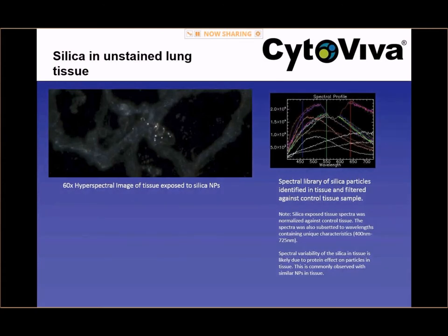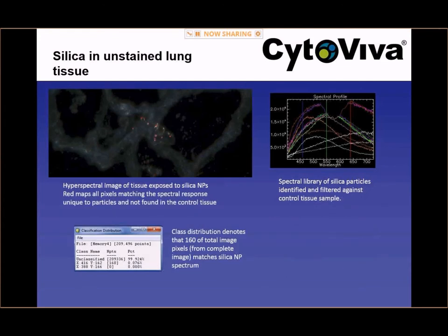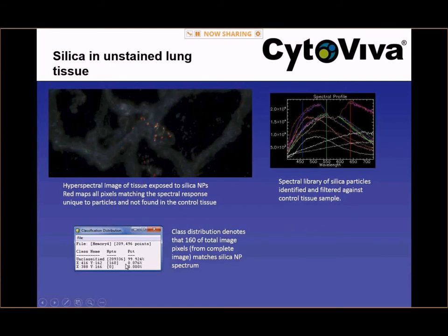In the next slide, you'll see a spectral library that was created using several different algorithms that help create good, valid spectral data. We use the mapping algorithm so that every spectral curve in that spectral library is compared to every pixel in the image. Every pixel that matches within a 10% measurement statistic validity is pseudocolored red. On the bottom graph you can see semi-quantitative data showing how many pixels in that image matched with the spectra in the spectral library. Once you have created good, valid spectral data, you can use it across every unknown sample in your experimental set.